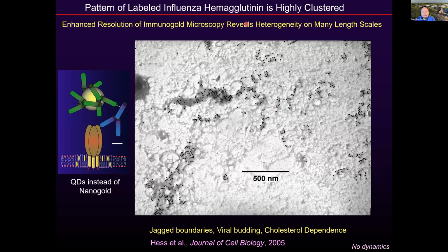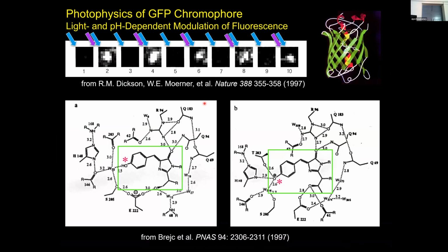And of course, the electron microscope has the ultimate resolution. This is some immunogold labeling of hemagglutinin on plasma membrane sheets. And these black dots show the locations of HA trimers, which are very much clustered. However, this is in a fixed cell far removed from living native membrane. So we still need something that can work in a living cell, which is going to depend a bit on some things that I did as a graduate student.